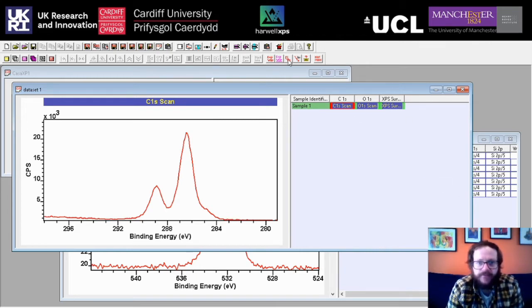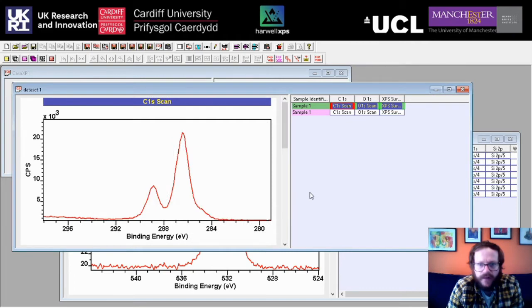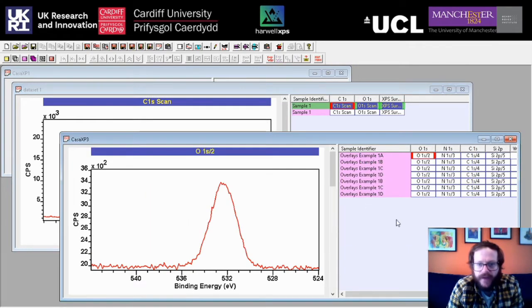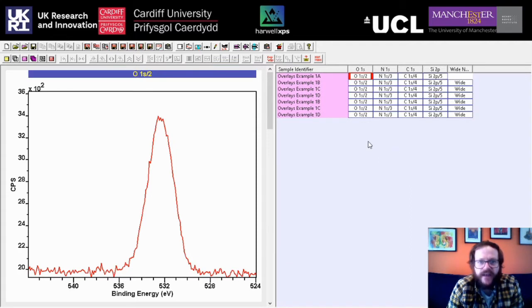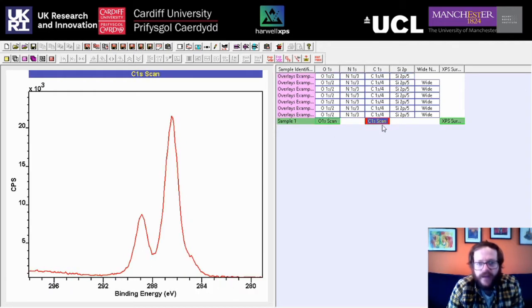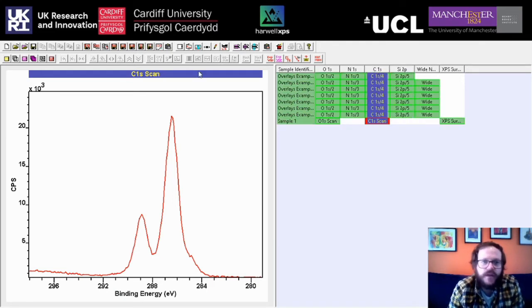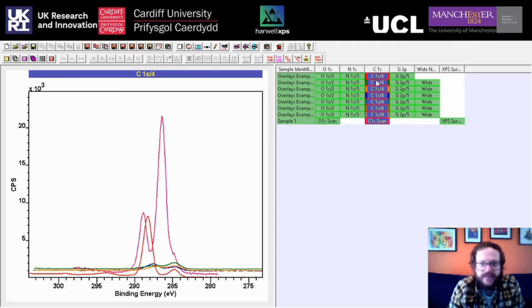With those selected, come up here and find the option to copy and paste VAMAS blocks. Give that a click and then click OK — it'll make a duplicate copy. Then come back to the worksheet where you have all of your datasets together and click copy-paste again. We now see that our new sample is down here and we have all of our datasets in a single file, which is really useful because we can do things like compare data — for example, overlaying all the carbons.